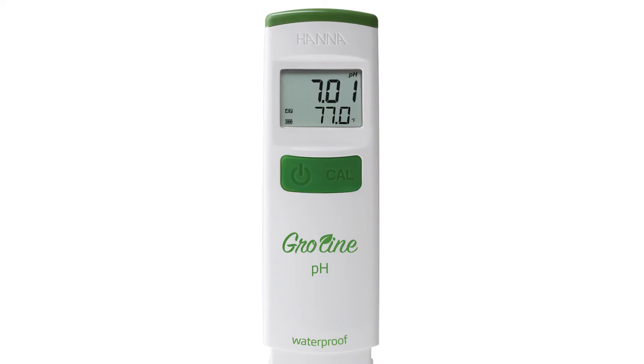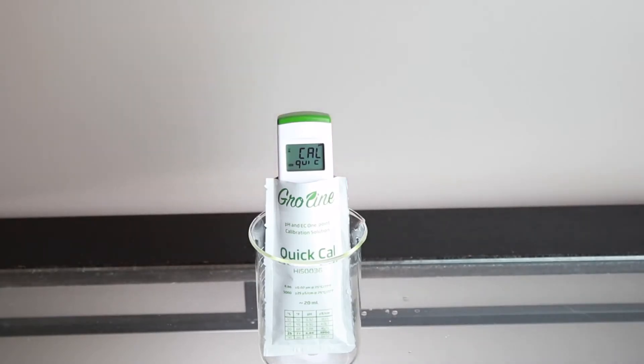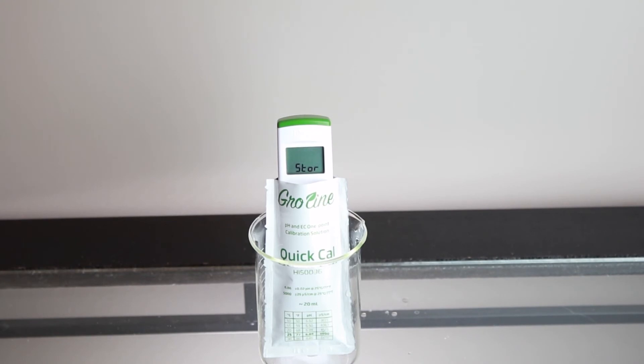Calibration is an important part of keeping your tester operating at its best. We recommend calibrating before each use. To calibrate your tester to one point, press the Cal key. Rinse it in distilled or deionized water and place the tester in your HANA Growline Quick Cal Calibration buffer. After it's complete, the meter will automatically return to measurement mode.